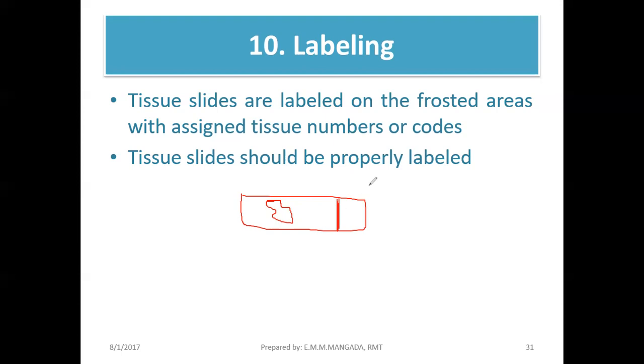They label it using yung tinatawag nating accession number, yung number na naka-assign dun sa ating patient, dun sa ating registry. So yun yung label nila for histopathology. But for histology, we just simply put kung anong type ng specimen ito. Is it simple columnar epithelium? Coming from where? The digestive tract, for example. So that's labeling. You have to label your specimen.